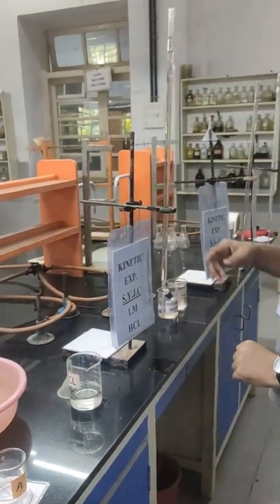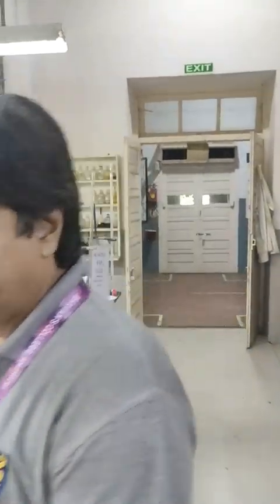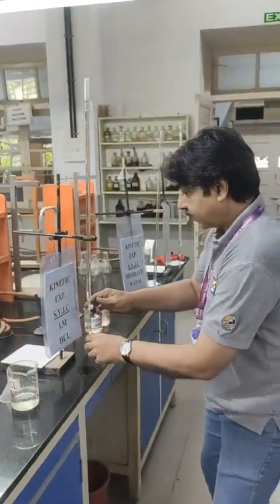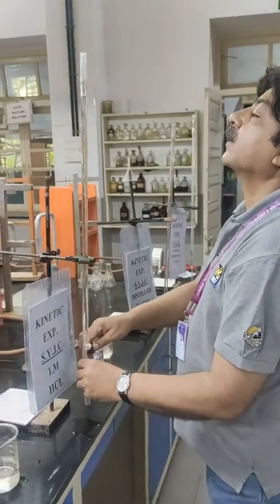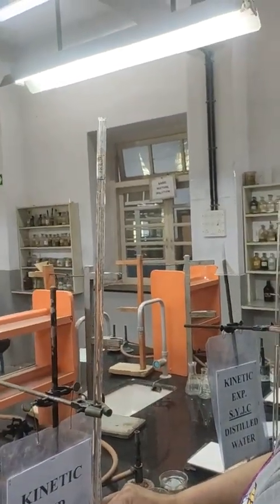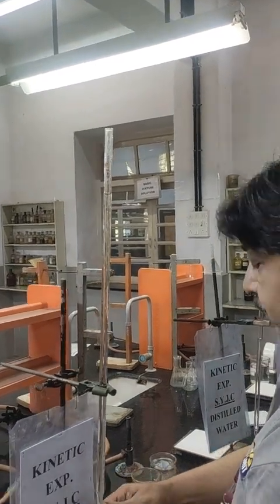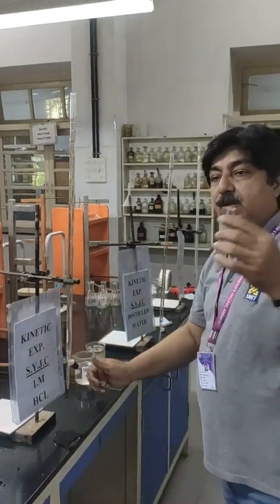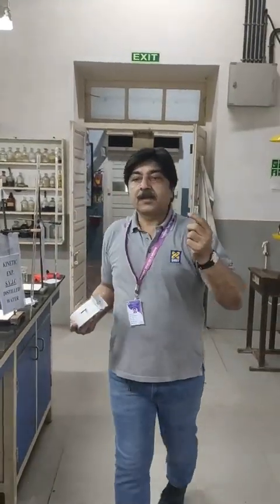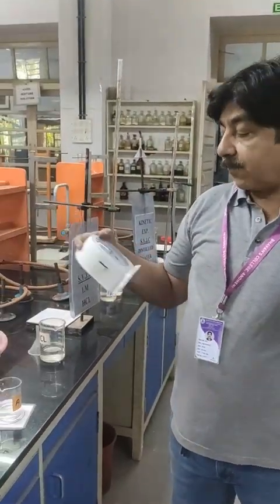Now I will take 2 ml of HCl. In a test tube, I will take 2 ml. 2 ml of HCl has been taken in this test tube, and I have to record the time now. So I have a stopwatch with me.